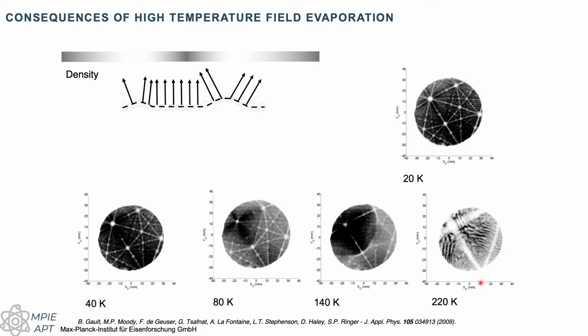At about 220K, I see this sort of wavy pattern. The 002 is still there somehow, and the main zone lines also still appear, but I would not really trust that data, because it means that locally we ended up with ions, atoms probably moving on the surface before the field evaporated to form this sort of wavy pattern there.